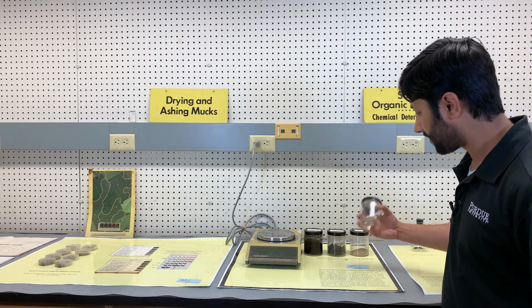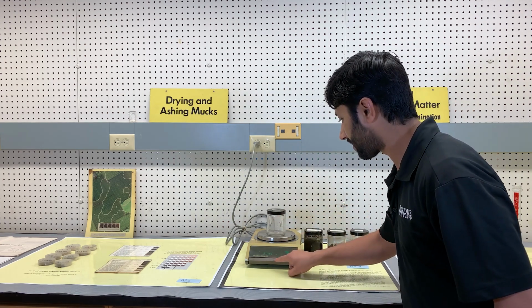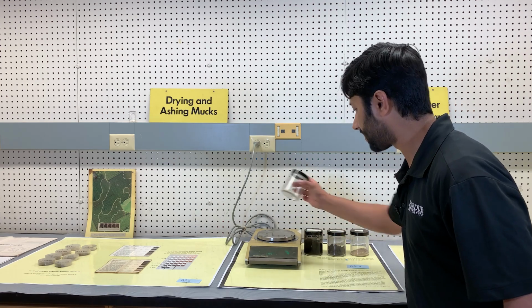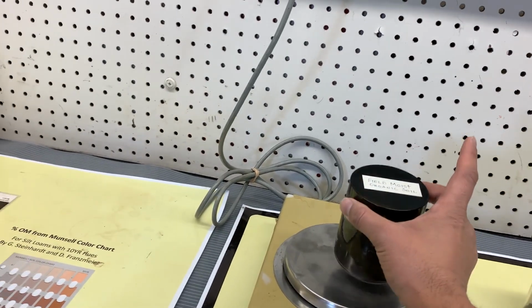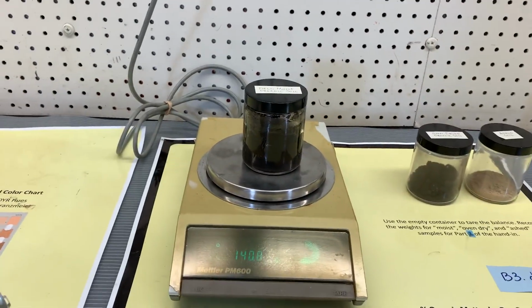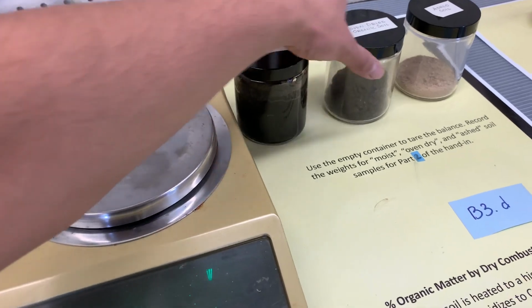All of these have the jar weight, so we need to remove the jar weight first. So that is counted as 0 right now. And then we will place the field moist organic soil, with a weight of around 157.6 gram.